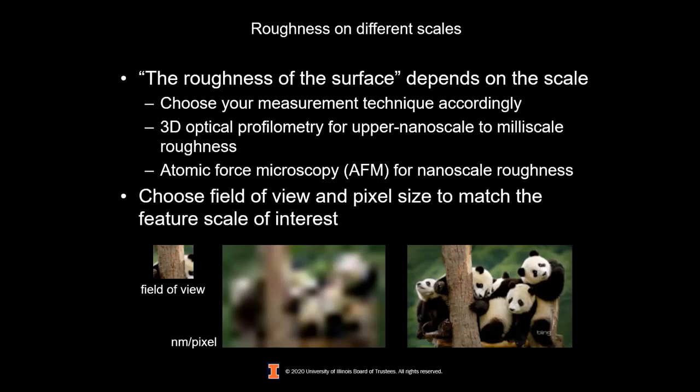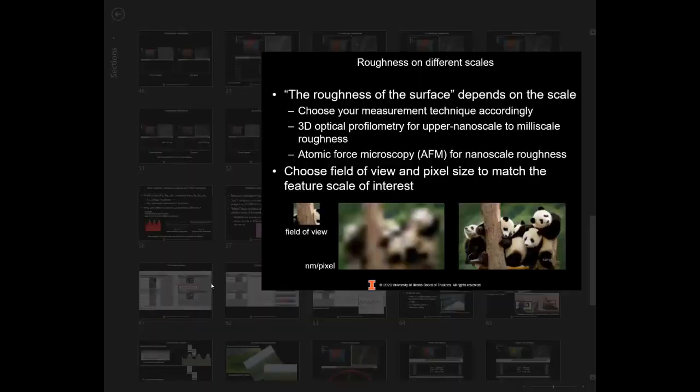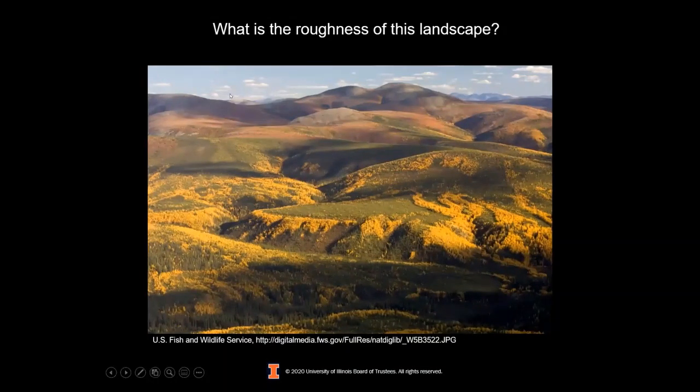But at a certain point, as you start increasing the field of view, you'll start running into different features like the waviness here. So the problem that the person asking the question brings up really well is that as you are increasing your field of view, you'll also potentially capture different types of roughness on your sample because you are exposing yourself to different sample areas that maybe your initial field of view was too small for. So that's the right way to do it.